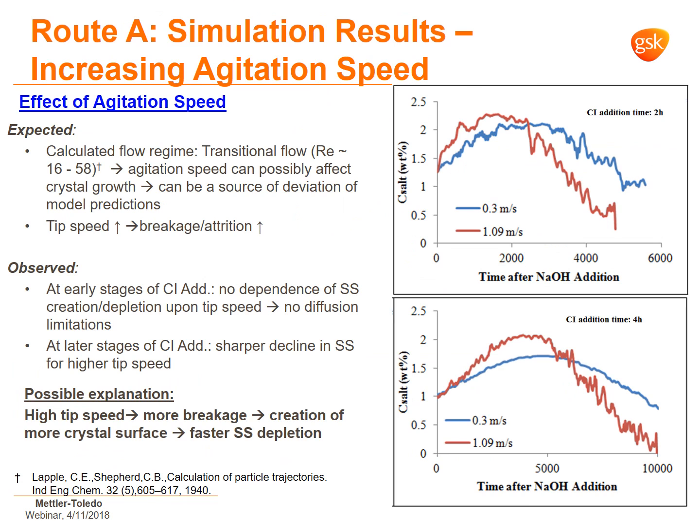As for agitation speed, we did calculate the flow regime, which resulted in transitional flow. That's one of the explanations also, because we still have streamlines. Maybe that leads to the stacking of the needles in solution. So we did look at the difference. This is just FTIR data between two different agitation rates. The counterion addition was added over 2 hours.